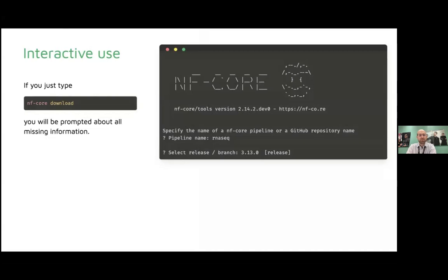If you just type nf-core download, the tool has an interactive mode. You will be prompted for all required information step by step — starting with which pipeline you want to download, then selecting releases, and so on. When you've completed that, the tool starts going. However, this is not helpful if you plan to download many workflows or want to automate and script it in the background, so there are a variety of command line arguments available.